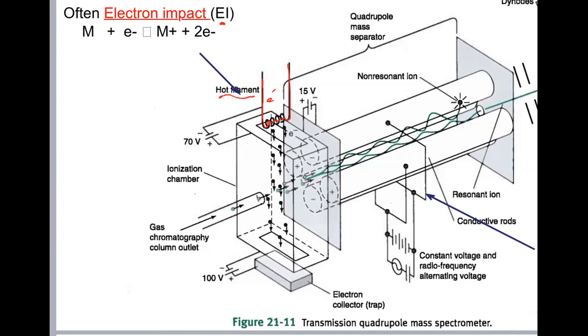And it turns out that some of those electrons are emanated from the filament. The filament basically gives off, or produces, these electrons, okay? Now what happens after these electrons are produced? They are accelerated towards this positive electrode, called the collector trap electrode, at the bottom. Notice here that we apply 100 volts DC potential. That's 100 volts positive right there, right?